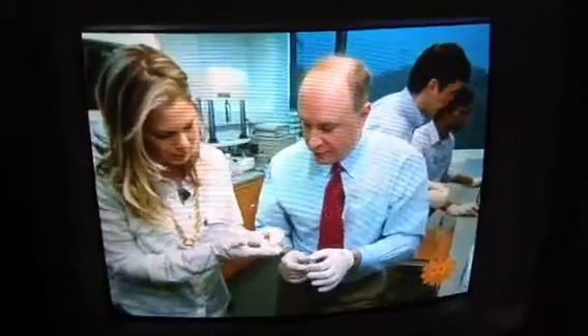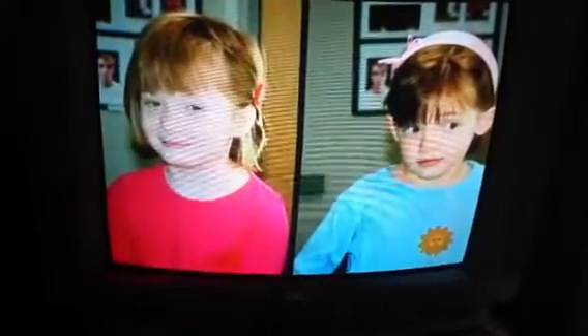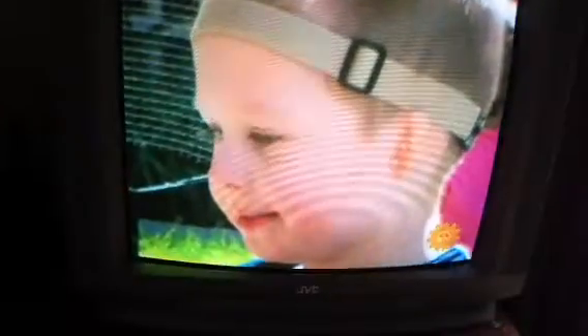Currently, the printed ears are in animal trials. It has the feel of tissue. Bonassar modeled the ear after his daughter's ears with the hopes of treating children born without one or both ears, a rare condition called microtia. Right now, the best treatment for microtia is sculpting ribcage cartilage into an ear.